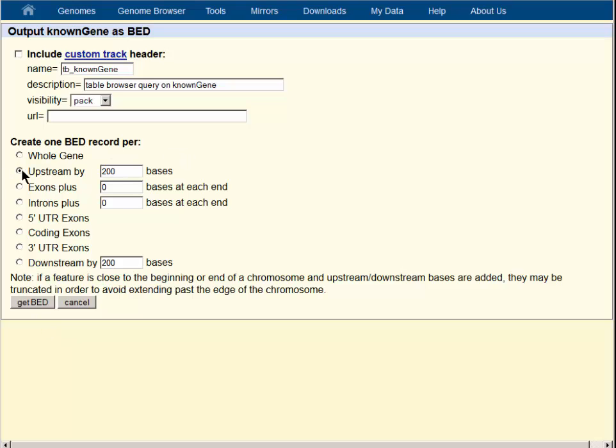The get output button takes us to a choice page where we can set some parameters. We'll create one bed record for the upstream region and we will accept the 200 base upstream default position. Of course, you're free to use whatever region you want.